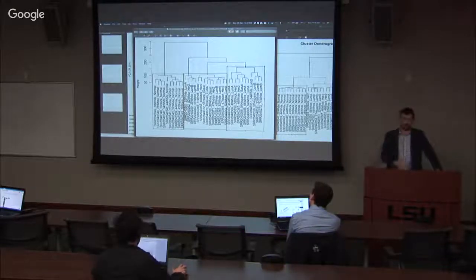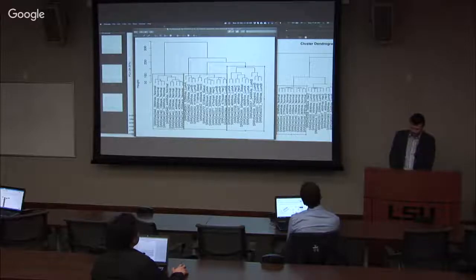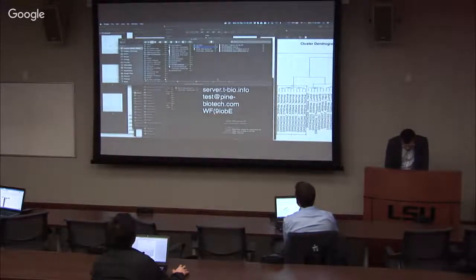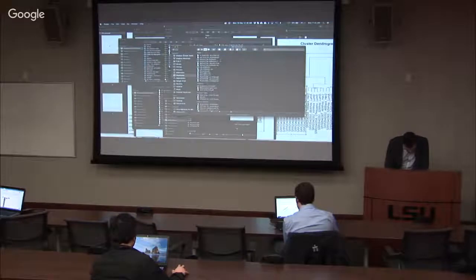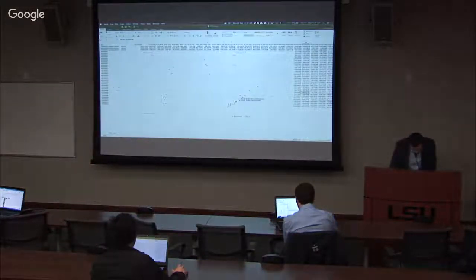And now, based on just my understanding of the data that I got from clustering, I will prepare a train and a test data set so that I can create a machine that will tell me why. So I can go back to my original data set, and let's take the normalized one that I prepared. So this would be right here, and we can open it back up in Excel. Maybe it's open.